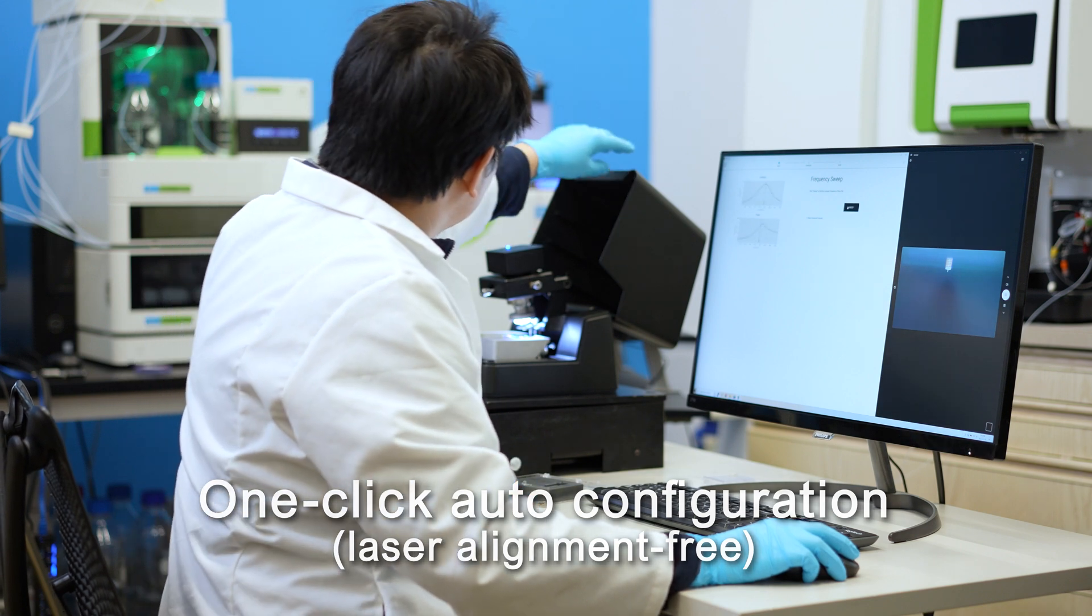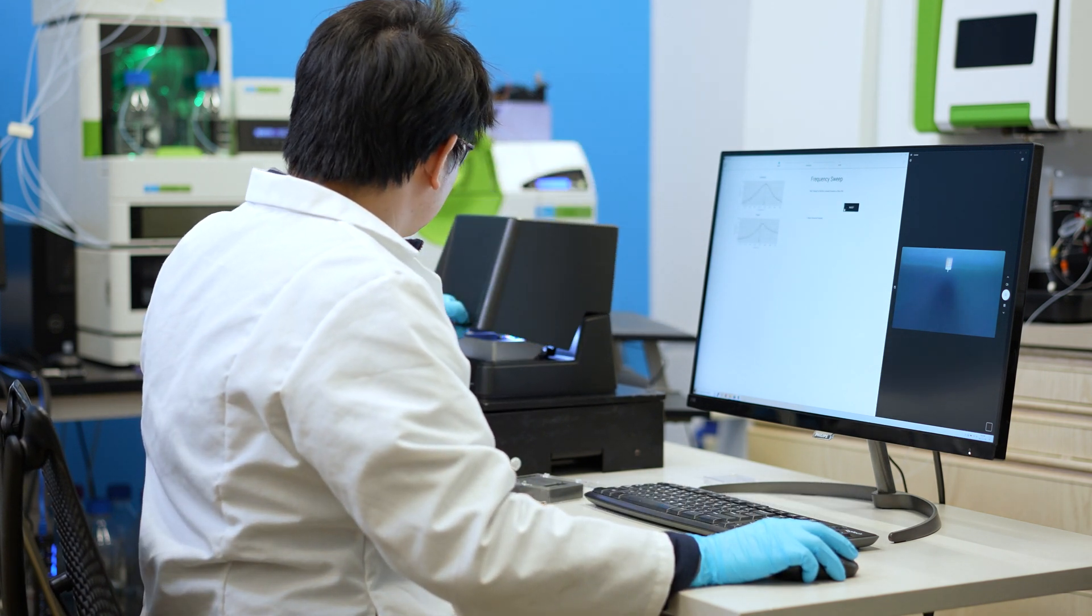Do a one-click automatic configuration. The Redux has no laser and is laser alignment free.